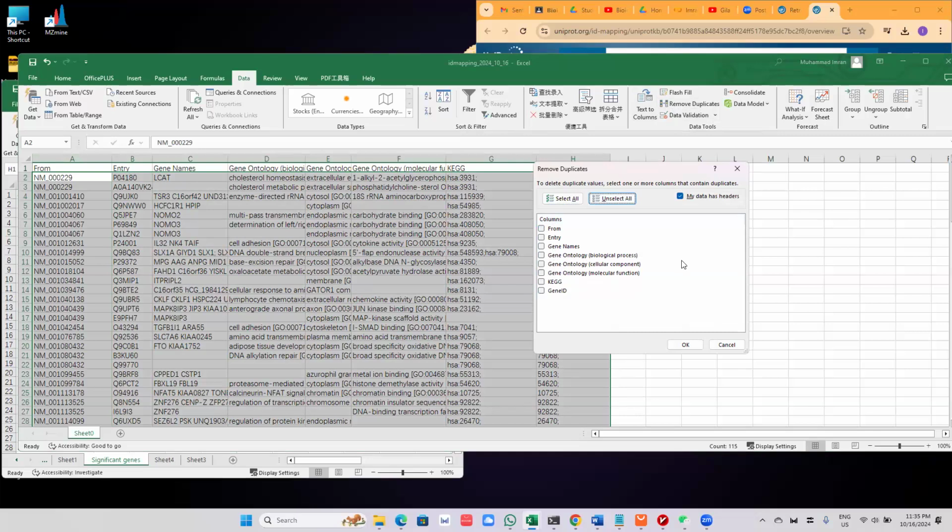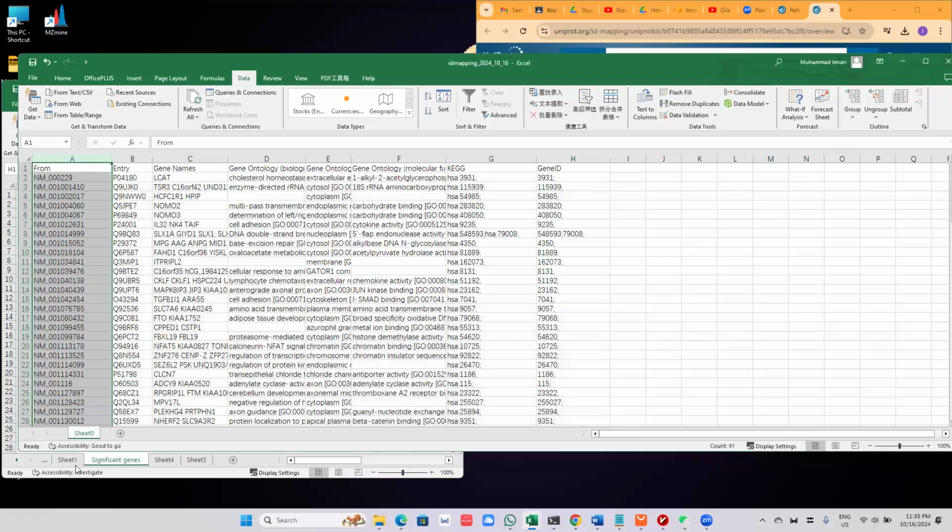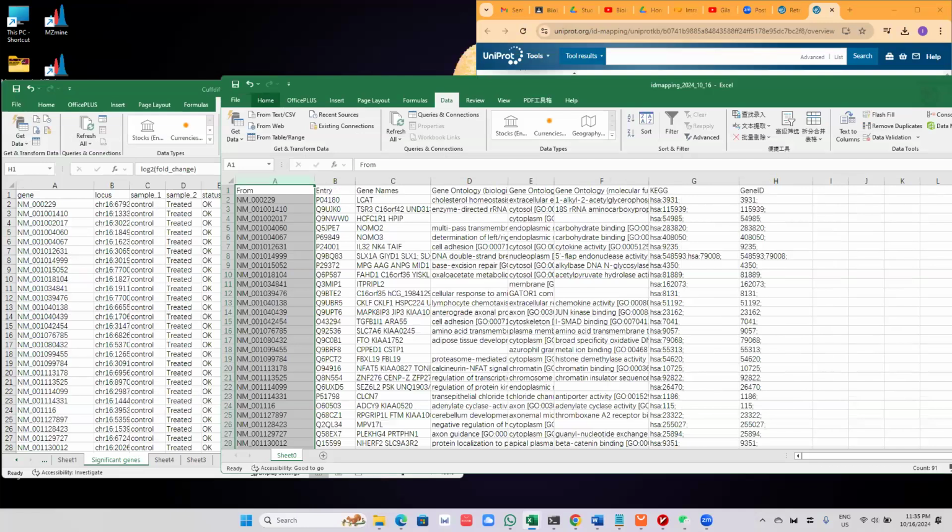Just select the from button and make it okay. Can you see? Okay now, ma'am. I will proceed further. Keep your screen share so that others can also follow.